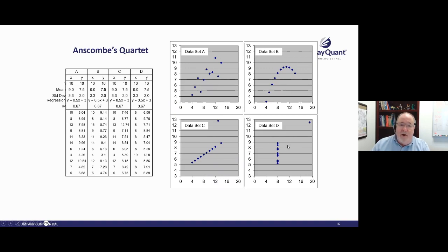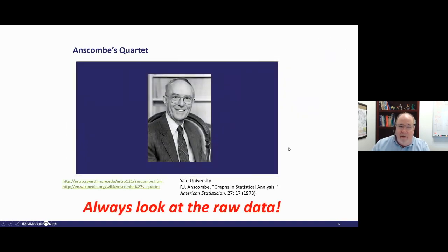So that's basically what Francis said here. He basically said, always look at the raw data. And this is very important. We all know the medicinal chemists out there who are interested in that number in the box, but we as the folks supplying this biochemical information need to provide the context to help them guide the SAR. And that means always looking at the raw data.